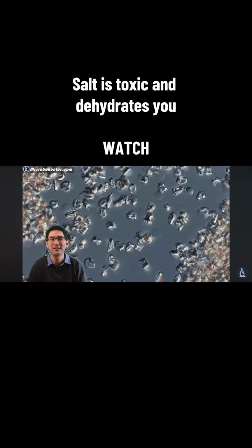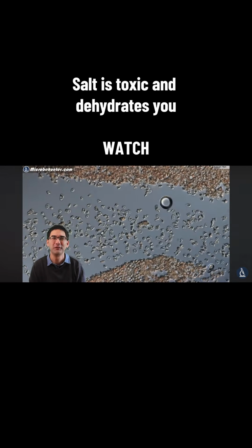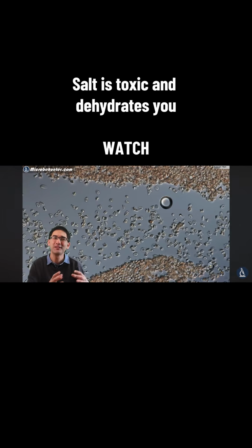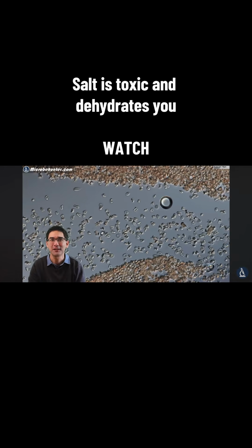Something I did not try is to reverse the process. Maybe that's the topic of another video. And here again there is the streaming now of the red blood cells as the salt water and the blood start to mix beneath the cover glass.